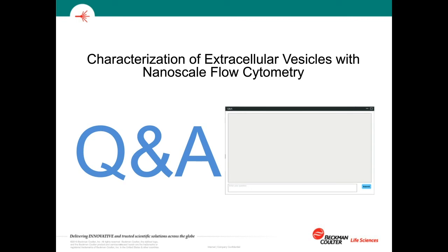Okay, George, here's another one. Will VSSC improve detection on any flow cytometers? Well, it depends. It can, but it depends on a variety of factors. Each laser on a flow cytometer has different power output. They may have different widths across the core stream and different focusing. It changes the power output at that specific interrogation point. But in general, the power itself is a big factor. So, for instance, theoretically, a UV laser may have even better sensitivity, but most UV lasers are really weak.